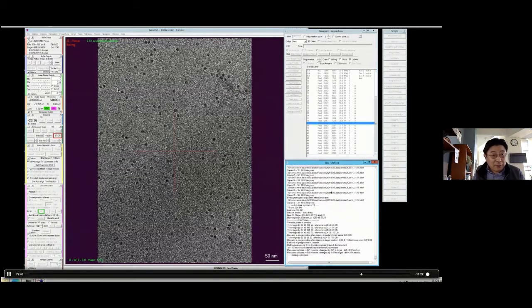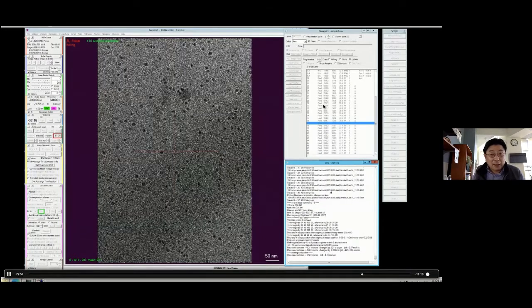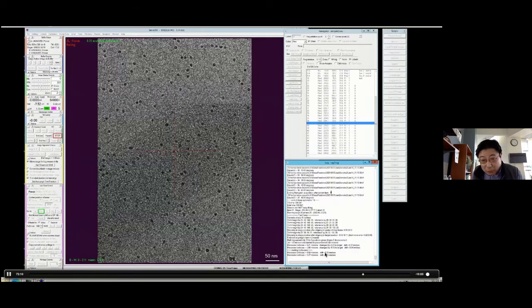Now this is basically going well. They stopped, and now we have 26 targets. Presumably you can easily apply this to multiple of them without slowing down your microscope, because the microscope continues to collect data. So I think this is good.